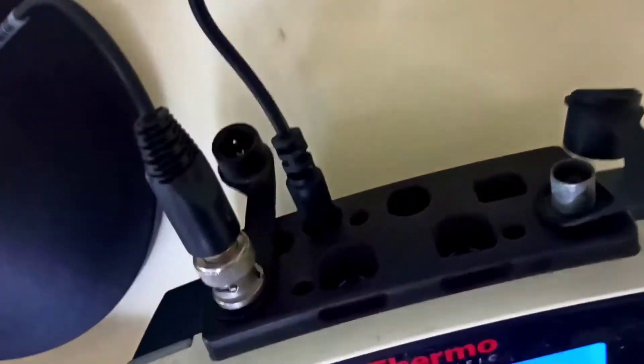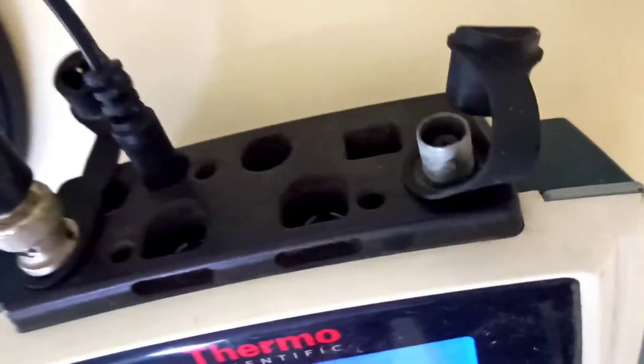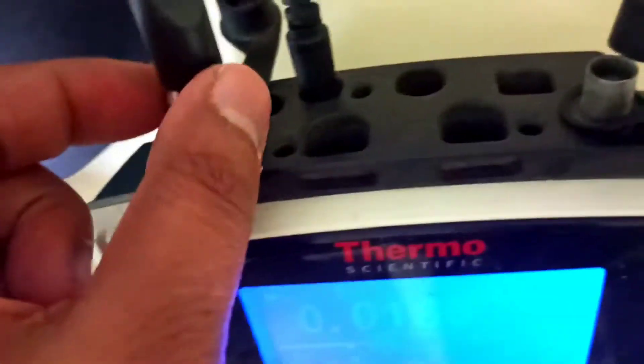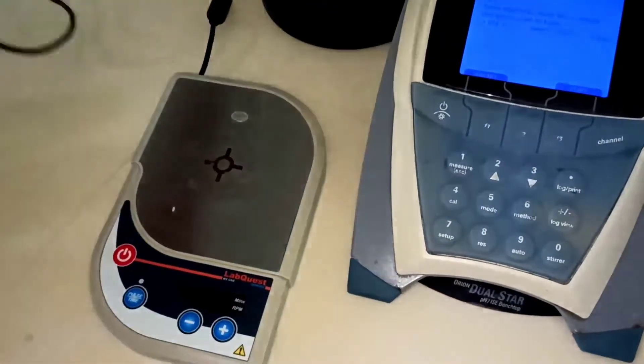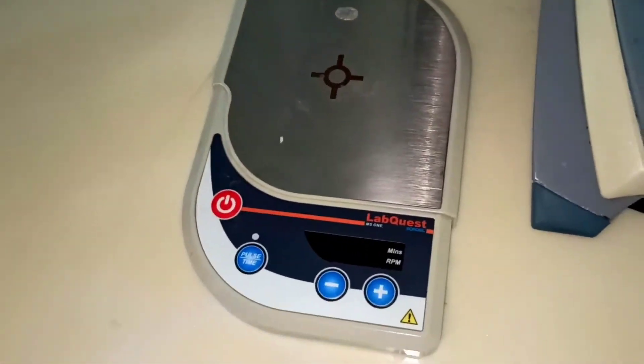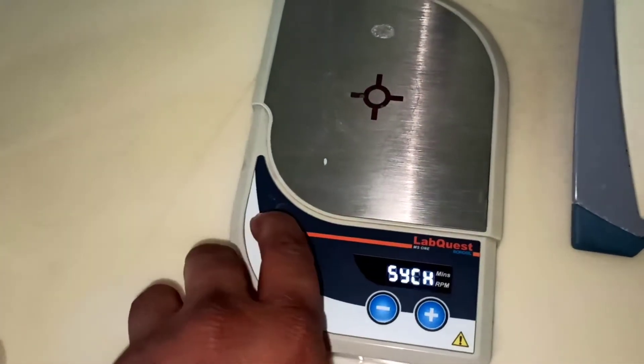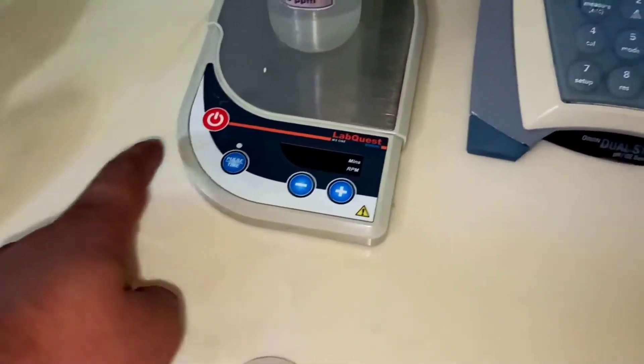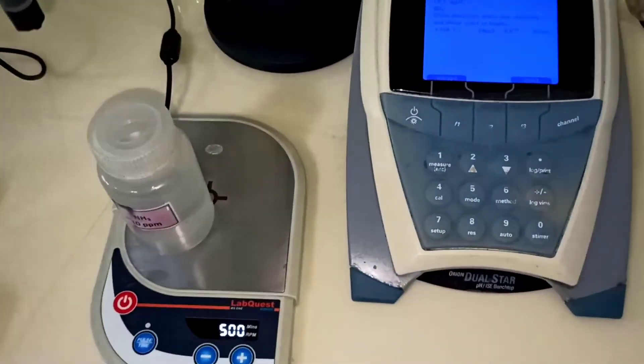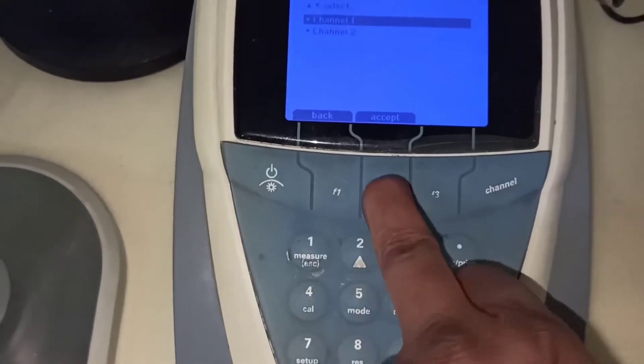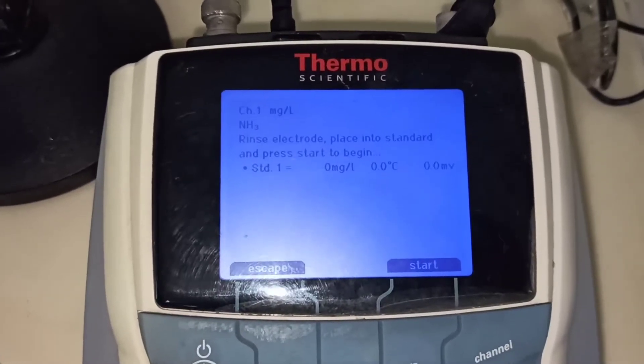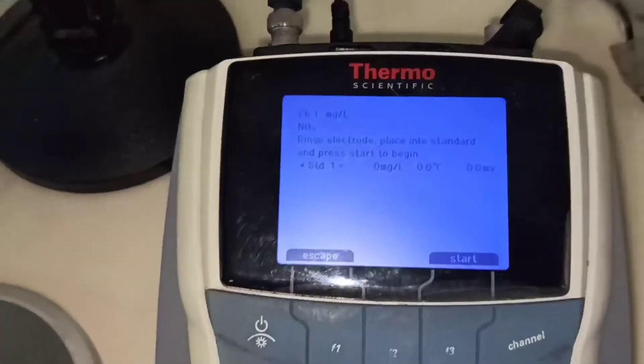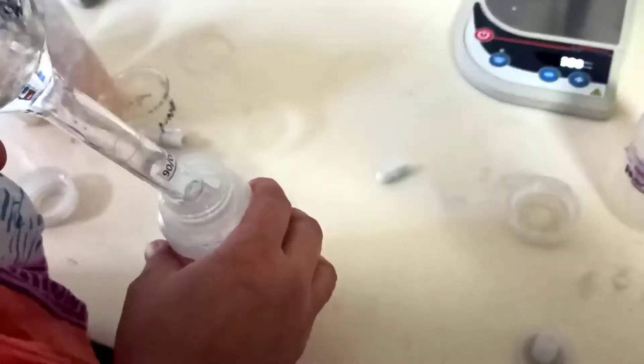Now our ion selective electrode is ready and we are connecting it to the left channel. There are two channels in this ion meter. We are rotating this knob and connecting our ion selective electrode. We are using the magnetic stirrer for dissolving the buffer in sample and in standard. It shows the RPM, revolution per minute, so we set according to our sample. Now start the calibration and select channel one. Rinse the electrode, place it into the standard, and our instrument is ready for calibration.